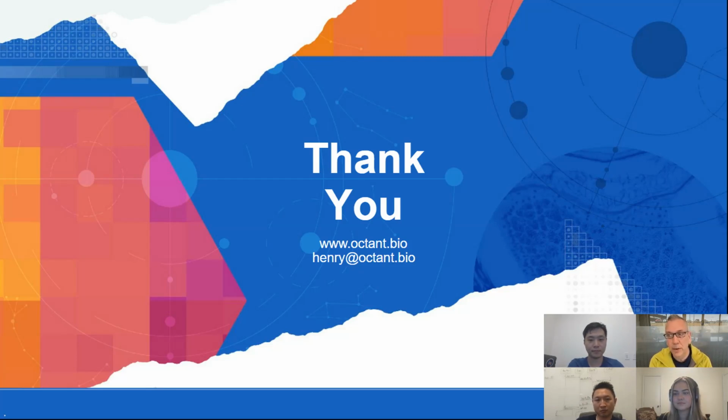But certainly looking across the spectrum at other platforms, there's some really exciting stuff going on, certainly in the long read arena. Some of the new platforms in that space offer throughput and cost that now really is going to motivate a high level of multiplexing as well. So we're very excited to start to think through how to implement some of these technologies on other sequencing platforms as they get out there. But more to come, and I certainly invite you to take a look at some of the work we've already put on our website in that regard.